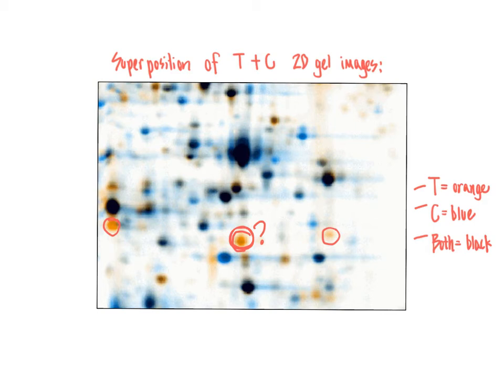And so that's why this technique is now typically coupled to mass spectrometry, where what would happen next is that these individual signals, these individual proteins, would be cut out of the gel, either using a scalpel in a non-automated fashion, or in some cases with sophisticated equipment, this can be done automated, so the system itself will cut this signal out of a gel. So we excise it or cut it out of the gel for mass spectrometry analysis to give us information on what the identity of that particular protein is, to take this a step further and have understanding of what proteins we are looking at here.